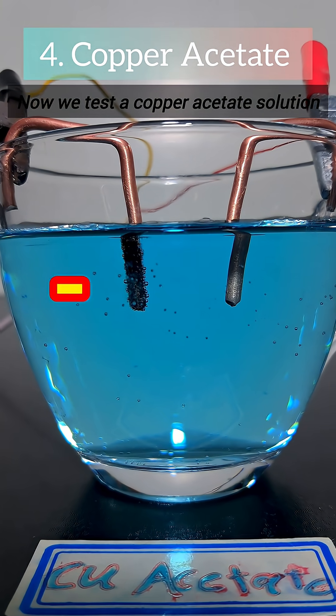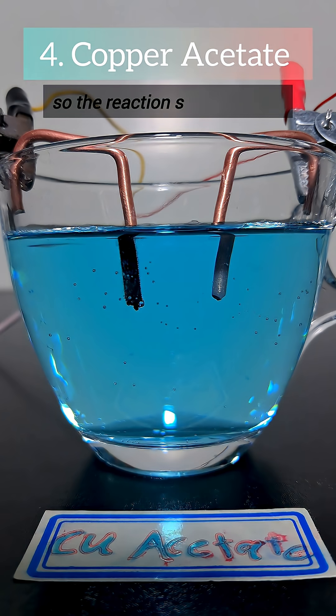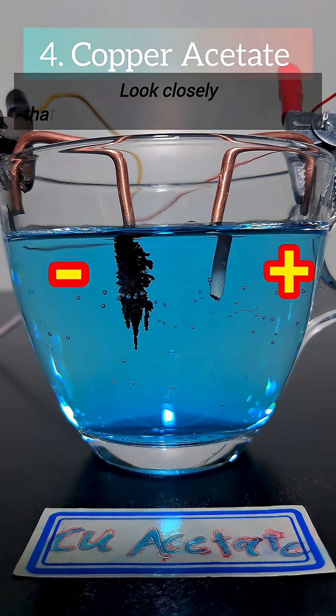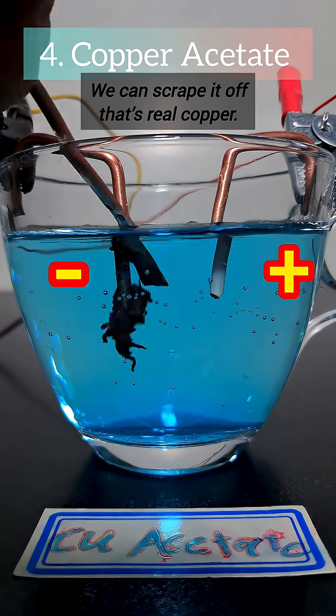Now we test a copper acetate solution. It already contains copper ions, so the reaction starts quickly. Look closely — that's copper building up on the wire. We can scrape it off. That's real copper.